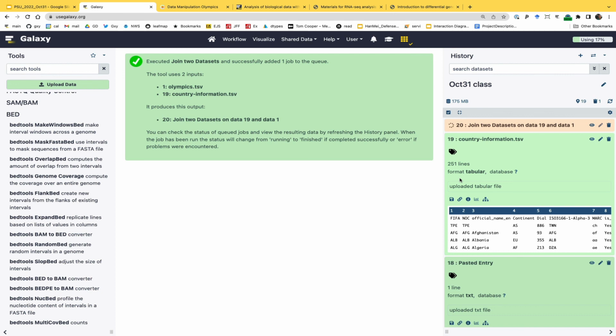And today, the reason I'm showing you this is not because I want you to do relational joins or grouping or filtering only in Galaxy. It's a general introduction to how Galaxy works. Imagine you can take any other tool or do anything. It's just to introduce you to the interface so you know how things get added here, so that sometimes they're red, and how you set the parameters and so on. We're not doing any analysis per se. We're going to start on next Monday. So today, just a taste of this.